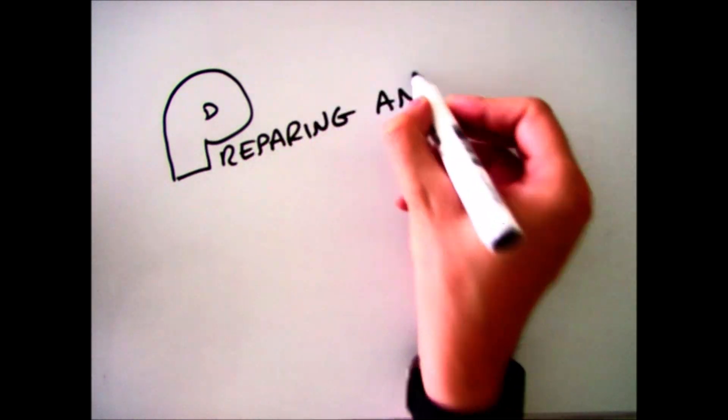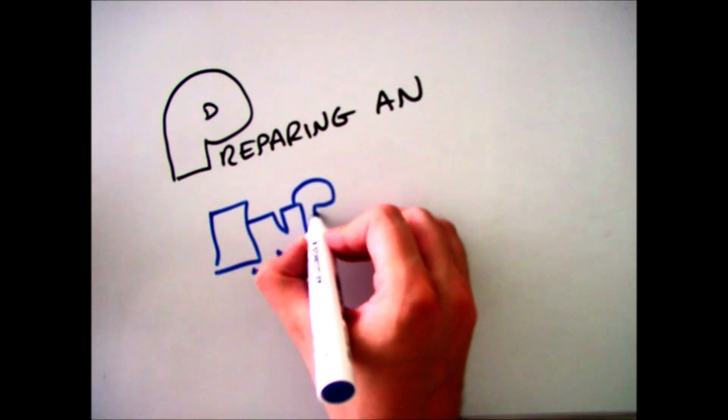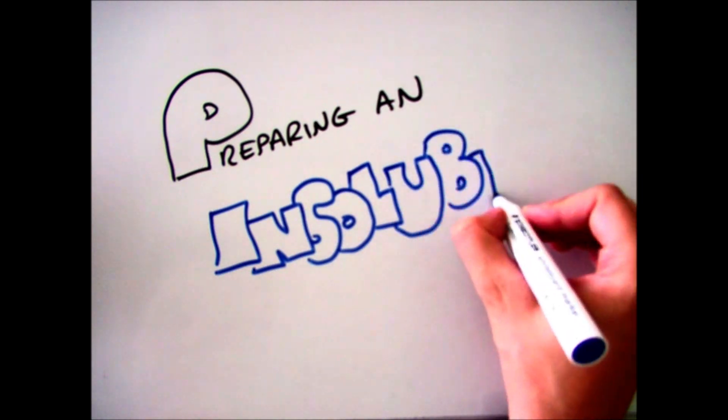Hello there and welcome to this video which is going to look through the practical technique of preparing an insoluble solid. In this case we're going to be preparing lead chloride.